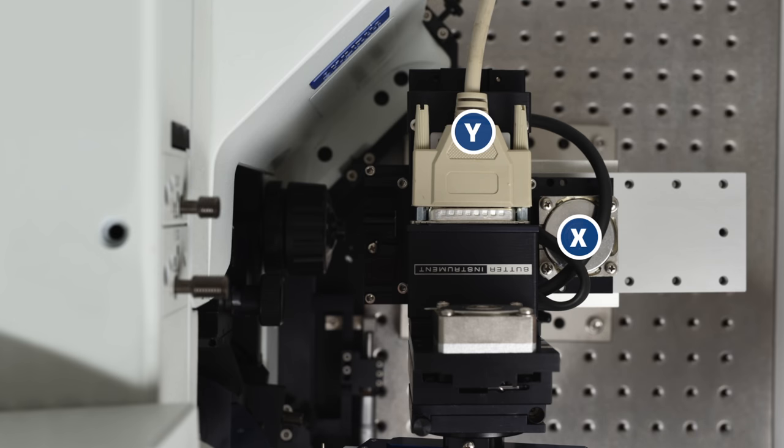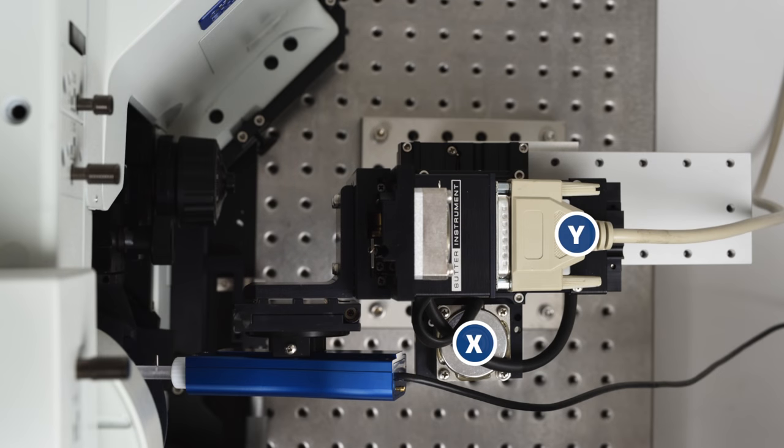By installing the right angle adapter, we have turned the manipulator 90 degrees. The X axis now behaves like the Y axis, moving forward to back, and the Y axis behaves like the X, moving from side to side.